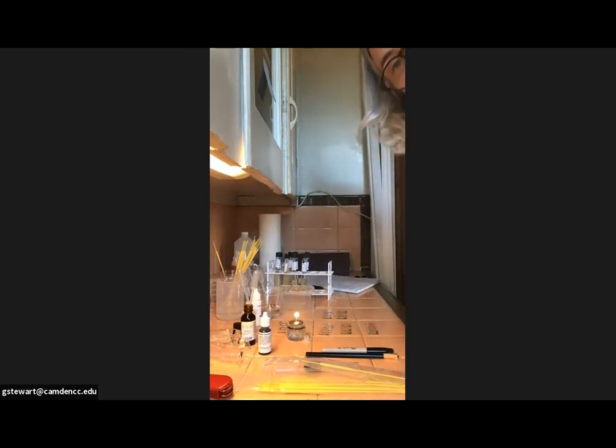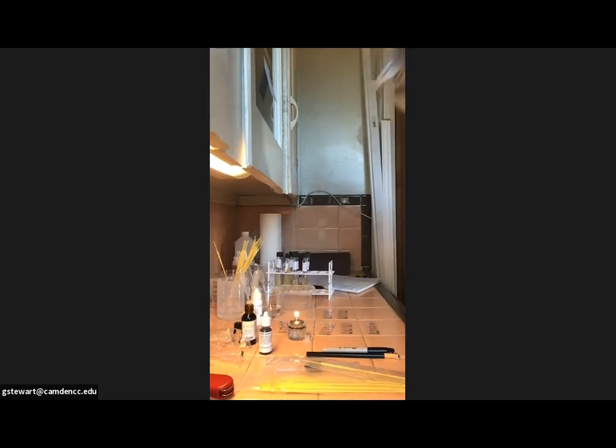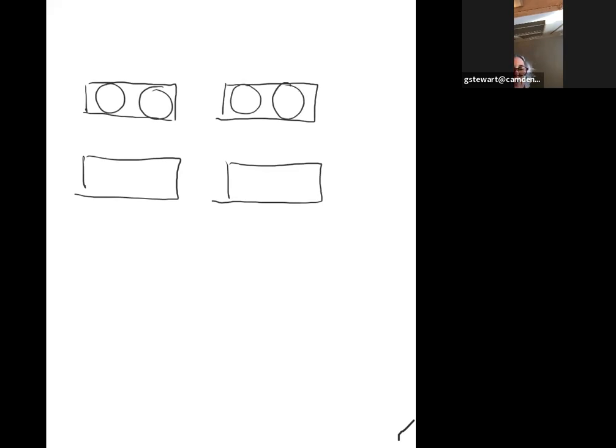Now, I want to real quickly go to sharing content with you, and I'll jump down here to a whiteboard. So my slides, how I set them up, just so you guys can see real quickly, this is for the gram stain. So they told you to make 2 slide 1s and label them A, B, A, B, and 2 slide 2s and label them A, B, A, B. And you know what? You can skip the letters if you want to just put the names of the organisms. So they're having you make 2 sets basically in case you have a mistake.